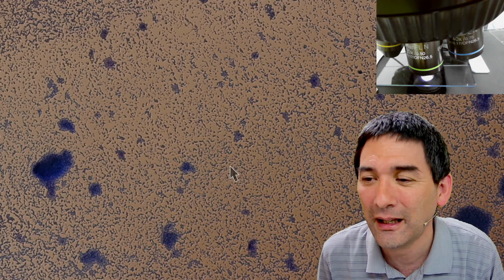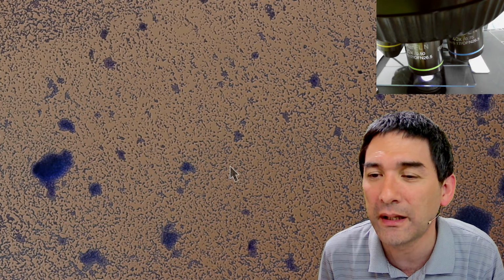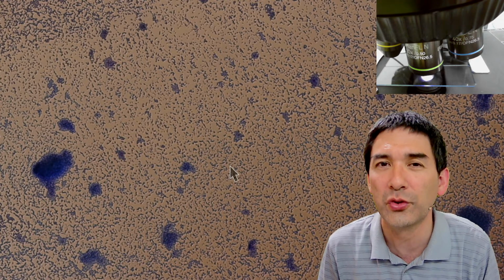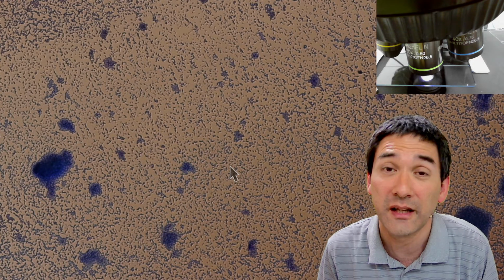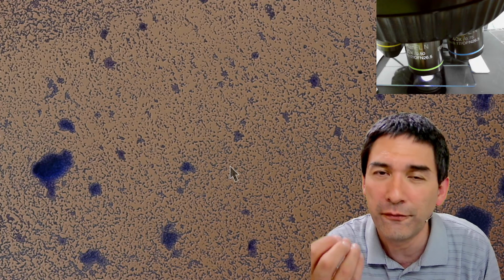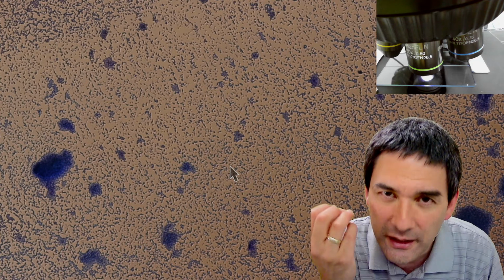And do you make fungus smears in the same way as bacterial smears? I've not grown some. Well, let's put it this way, I think that would be possible, especially if you are spreading the spores. However, fungi have the tendency to spread very quickly. The mycelia, the hyphae, radiate very quickly.